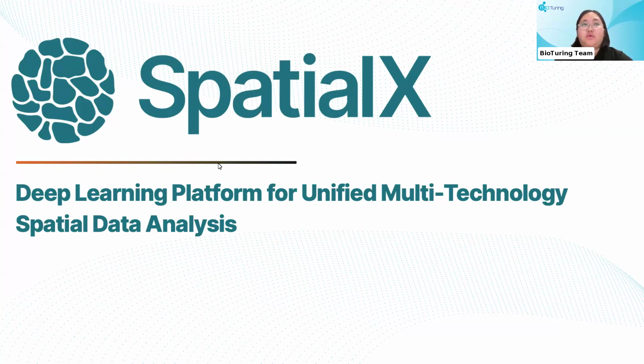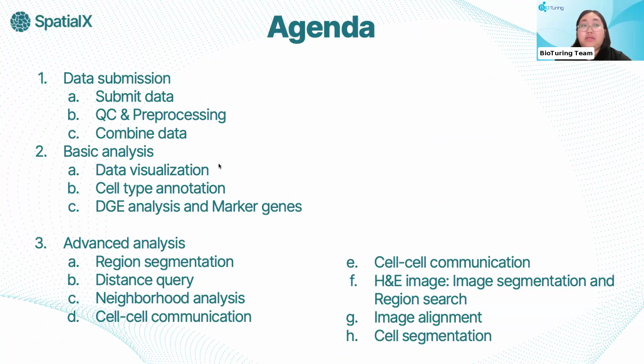So for today's session, we are going to explore the ability to work with Xenium data on SpatialX. We will go through how you can submit Xenium data on SpatialX and how you can perform some basic analysis on the platform, and if we have some time, I will walk you very quickly through different kinds of advanced analysis that you can perform using your Xenium data.